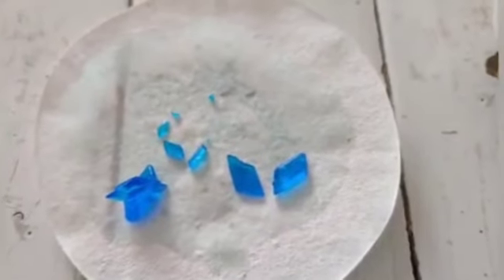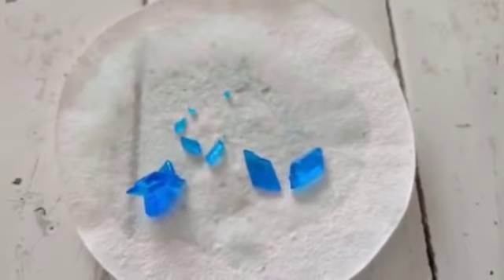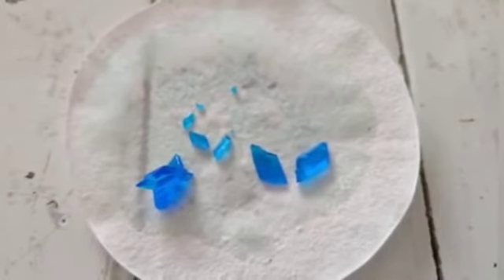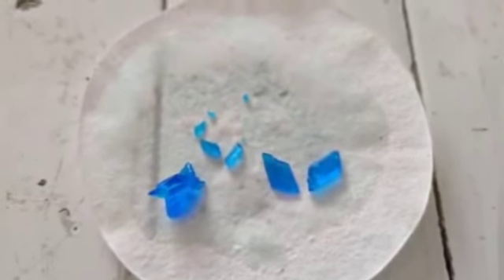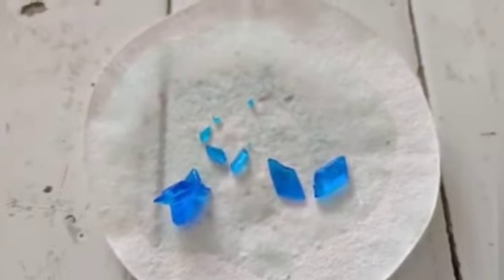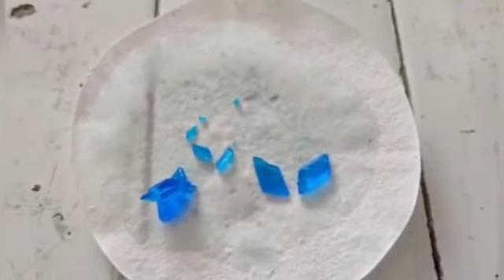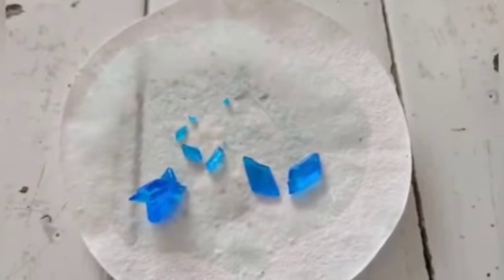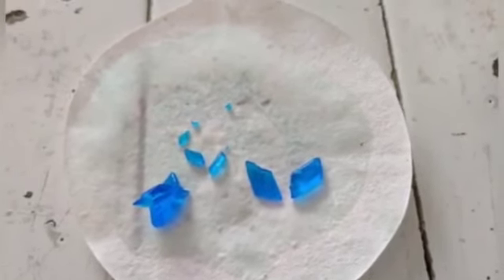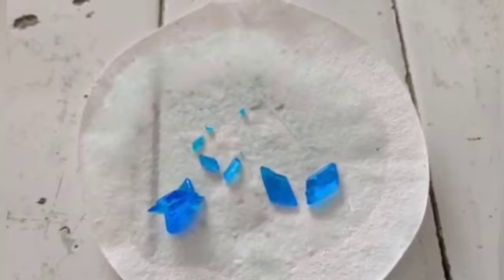The precautions to take during this experiment: we have to take a minimum quantity of water to dissolve the impure sample. The concentrated solution should be cooled down undisturbed, as even slight disturbance can change the shape, size, and quantity of the crystals. Also, we have to cover the china dish while cooling down the concentrated solution. That's all for this experiment, thank you.